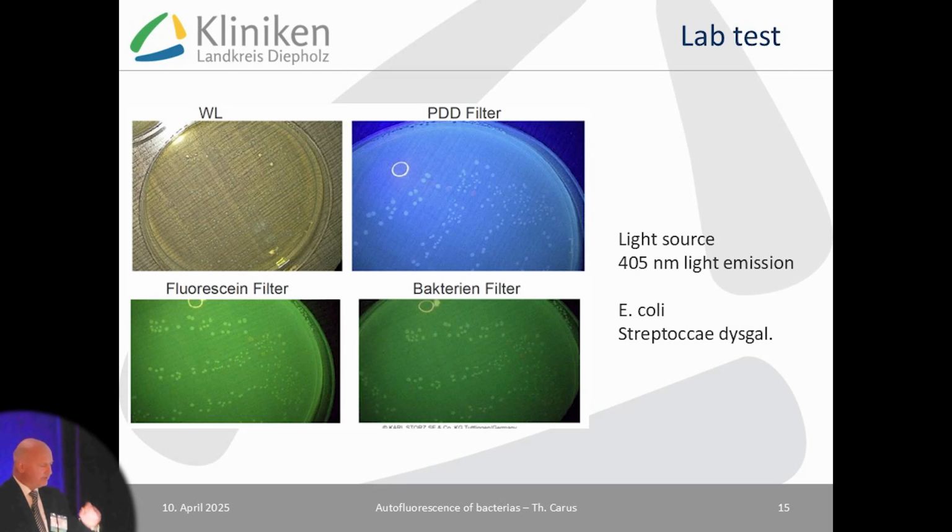Our first test was a lab test. These are samples from the laparoscopy, and we put them in these agar plates and incubated them in my office for 48 hours, and then they make the test with this light source, and we could show this is E. coli. In this example, there are only some little red spots to be seen. The others, I think, are already dead, these bacteria.